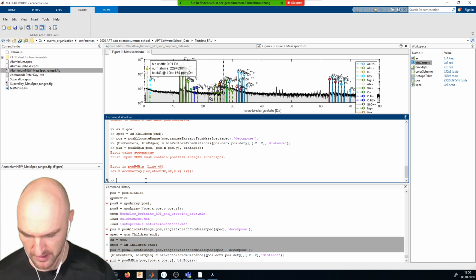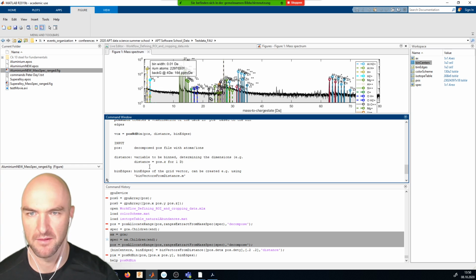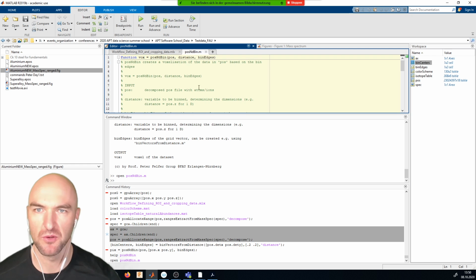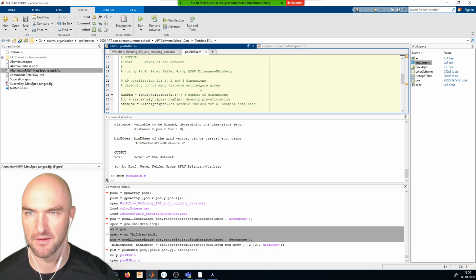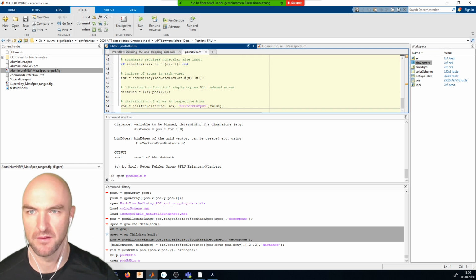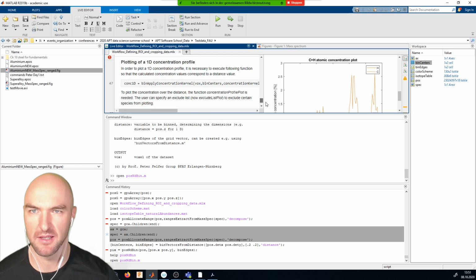Did I do something? Okay, let me have a look into the code. What did I do wrong?